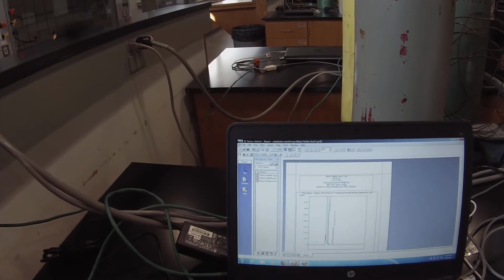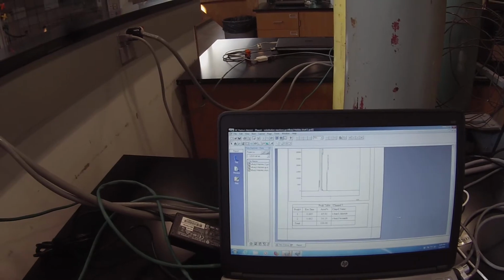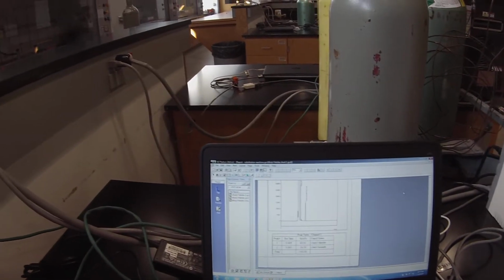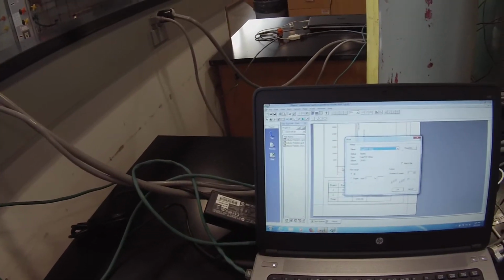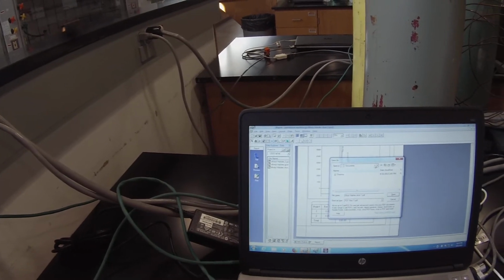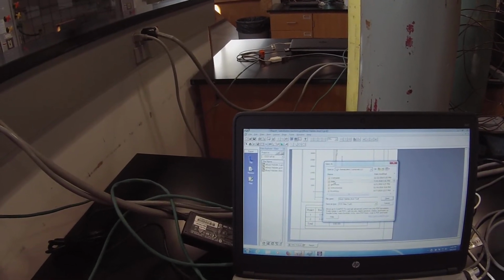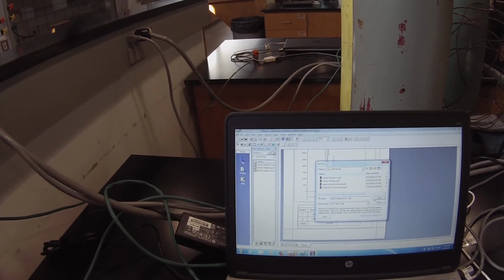Right, so there's the sample information, the chromatogram, and down here we have our percentages. I'm going to go ahead and print that. Pointing it at my own folder. Okay, data. 2020 fall lab, t-butyl halide short.